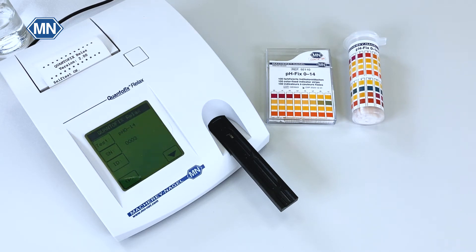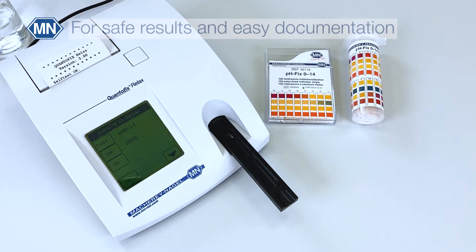Automatic strip reading has two major advantages: less errors and easier documentation. So if results matter — and they matter for anyone except yourself — then you may consider investing in automatic strip reading.